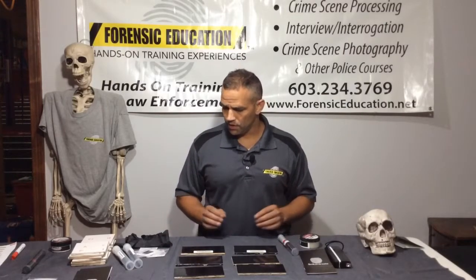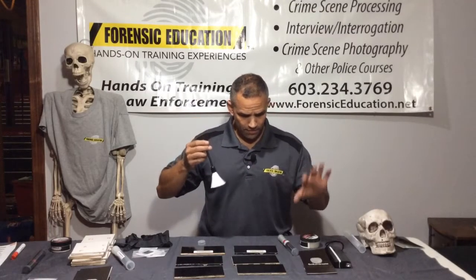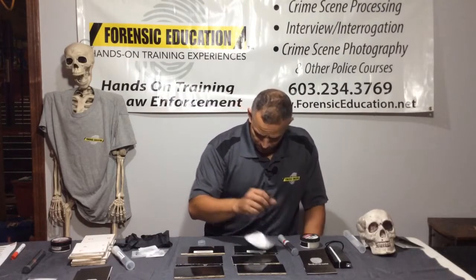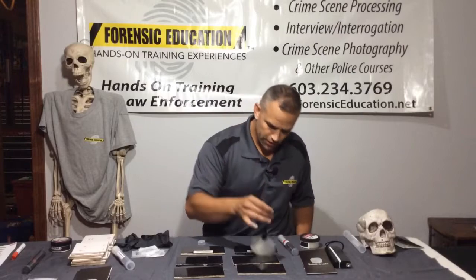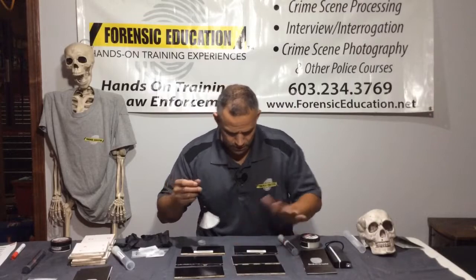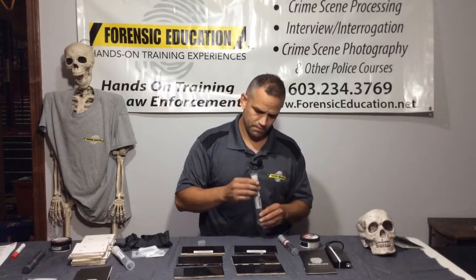The brushes I got from my friends are already loaded with the powder. Here's the sample bag, and here's the powder brush. I'm going to develop this side using Scaluminate. You develop it the same way you would a regular fingerprint — spinning the brush, barely touching the surface. I'm going to go back over it. Perfect. I'm going to put the brush back.